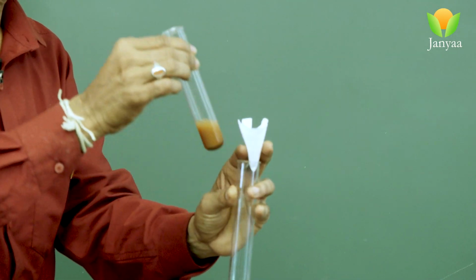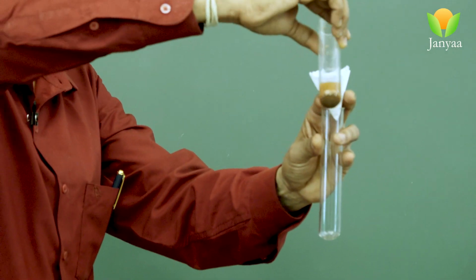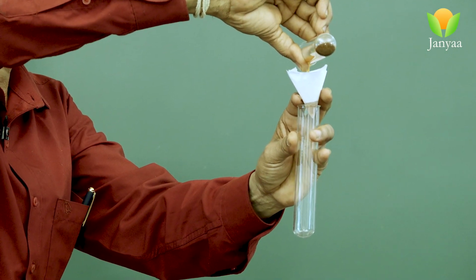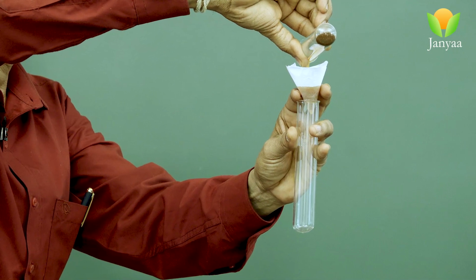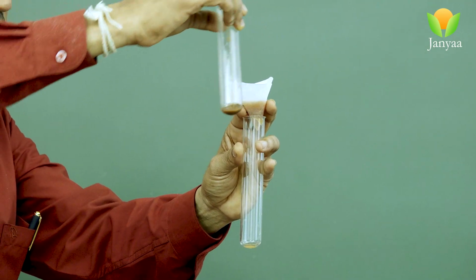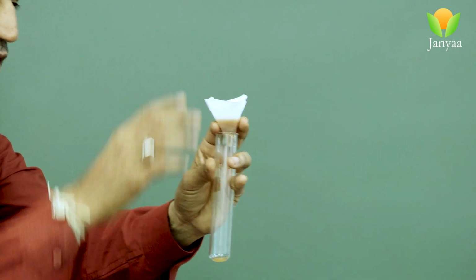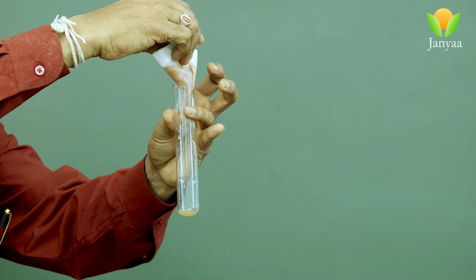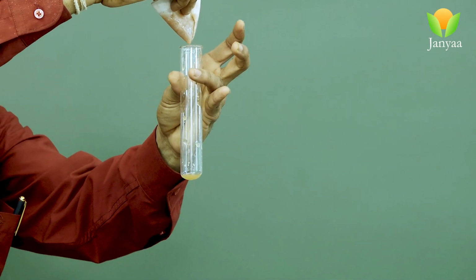Now I am pouring the mud water mixed solution and collecting the solution from this. You can observe that you are getting the soil water here.